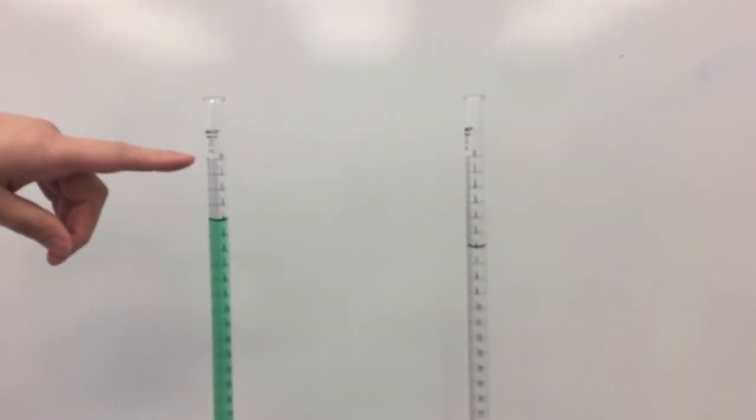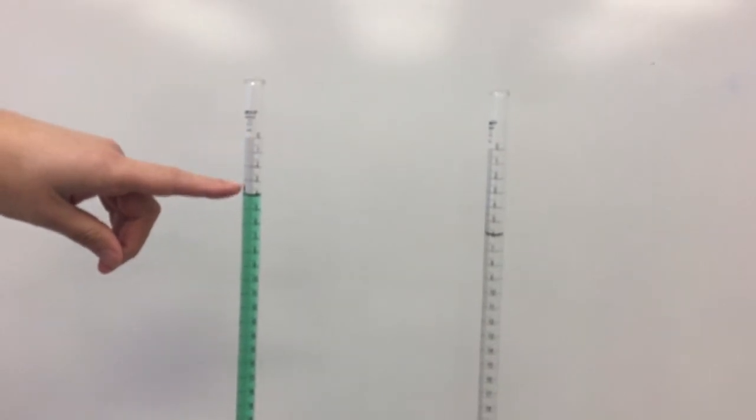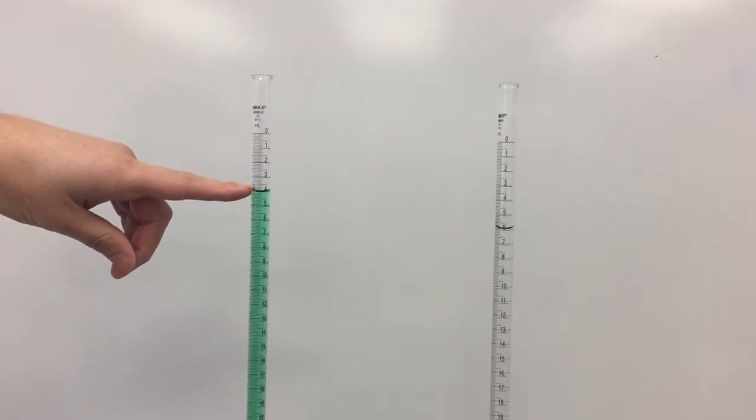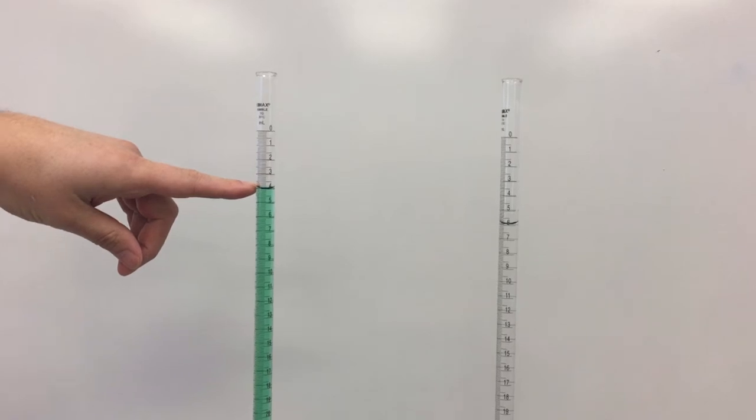When using a burette to make dilutions, first take note of the initial reading of the burette. The initial reading does not have to be at 0, but it does have to be below the 0 mark so that you can get an accurate measure.